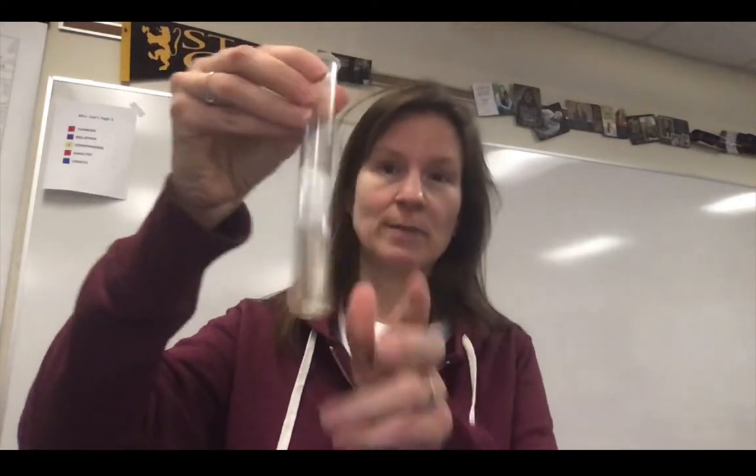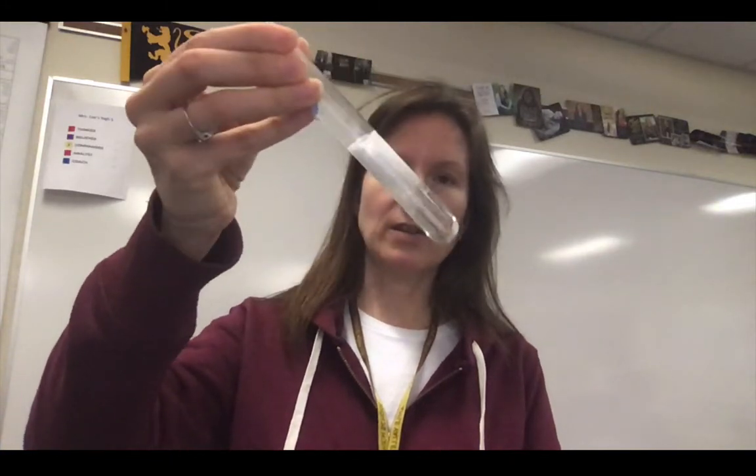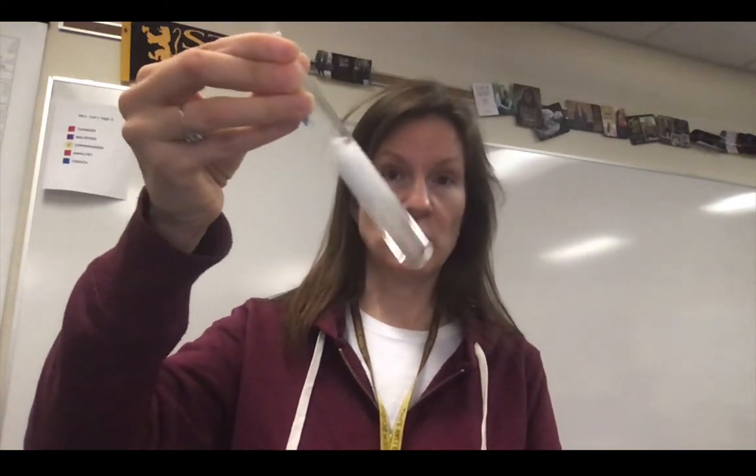So now in each test tube, I'm going to put the magnesium in and allow it to start reacting. This is what the reaction looks like when it's reacting. Lots of gas, lots of bubbles being created. It is warm to the touch as well, so you get a sense of what to write down. Okay, so this is test tube number 1. You can make observations on what it looks like during.